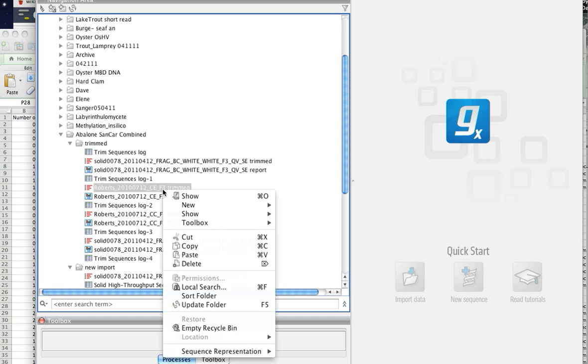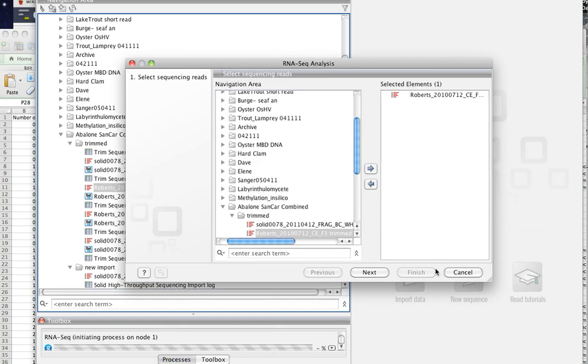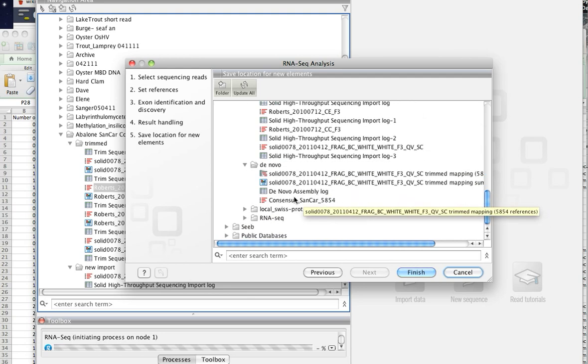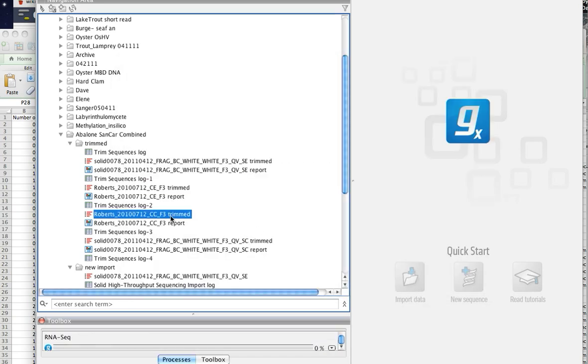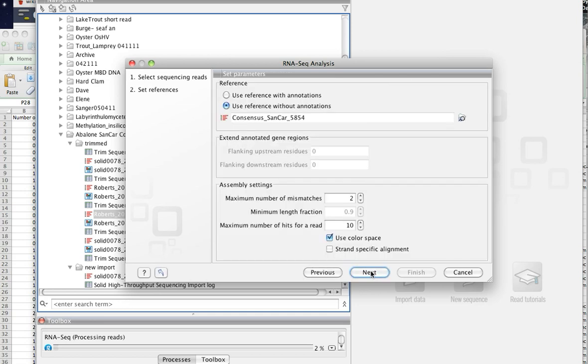Finish. We just do the same thing. So what it's going to do is take all your little baby reads, they're cleaned up, and map them back onto this common backbone. Can you do all 4 at once? Yeah, you can, but it's not the point. So now you can have 4 separate expression files, and you can compare them. You could do them all together, but then you just have one expression file.